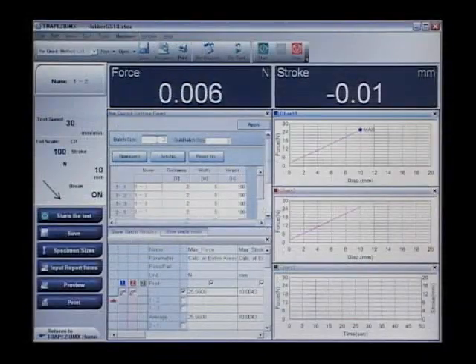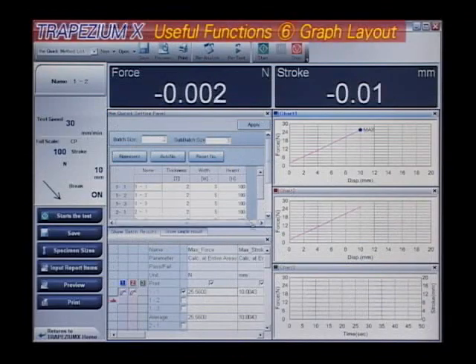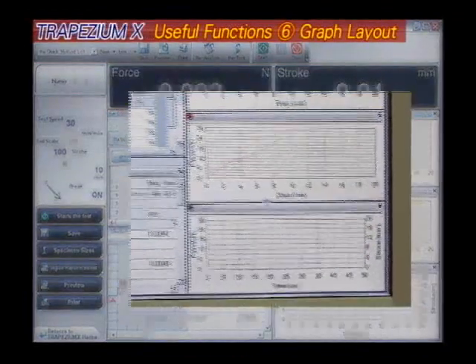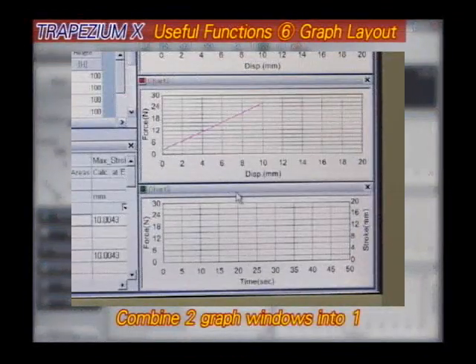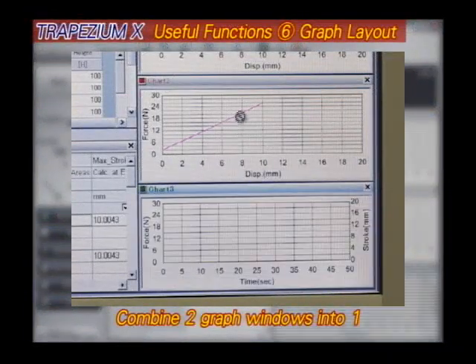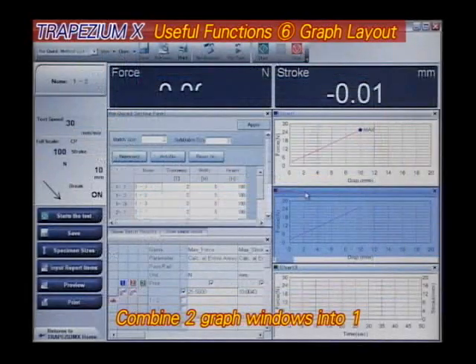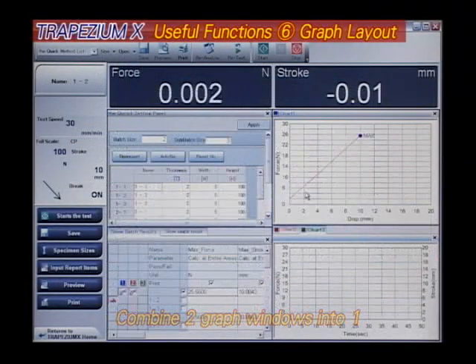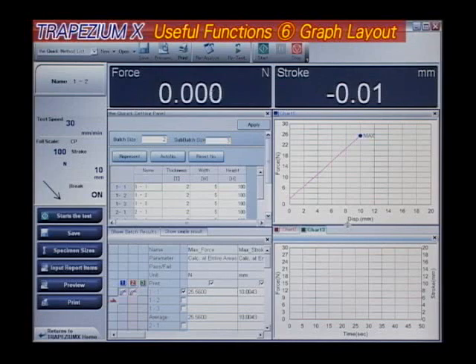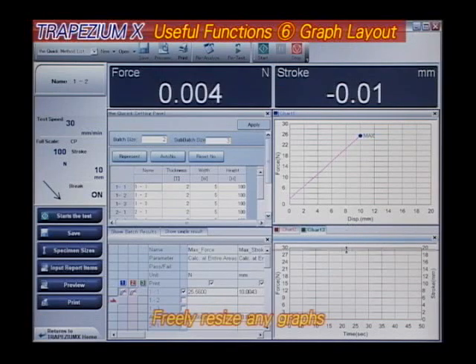Graph layout. Freely adjust the position and size of graphs to suit your needs. Usability has been greatly improved, allowing graph information to be easily resized and placed in almost any location.